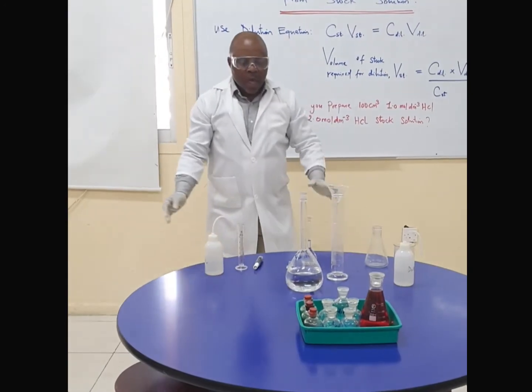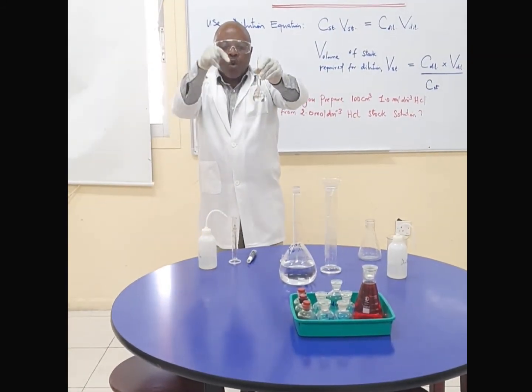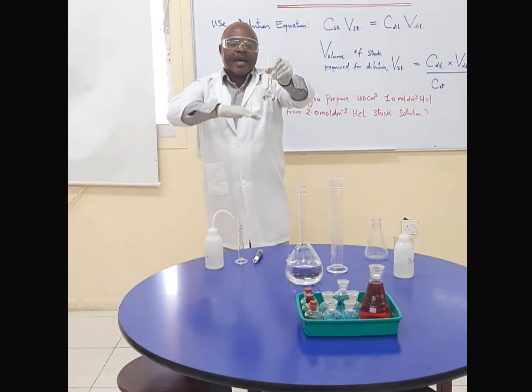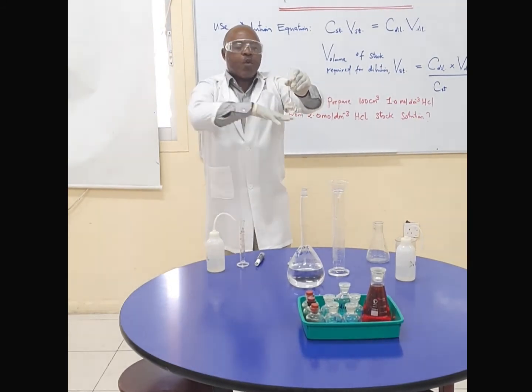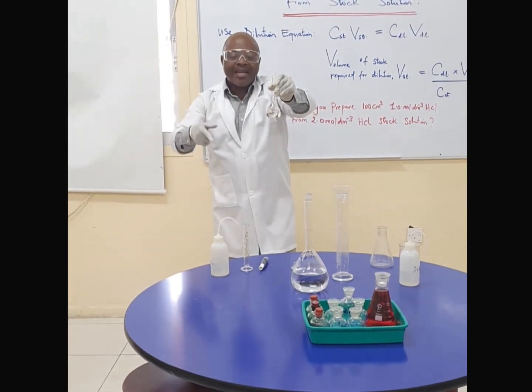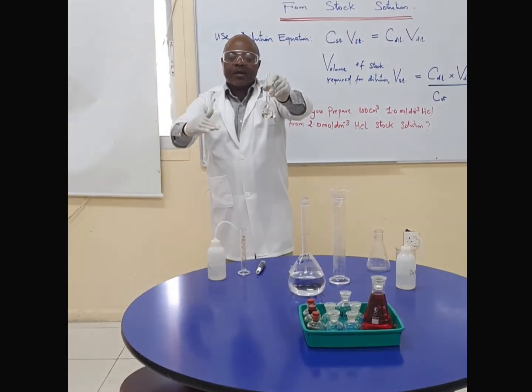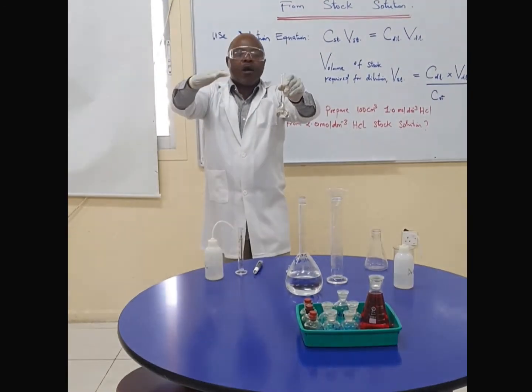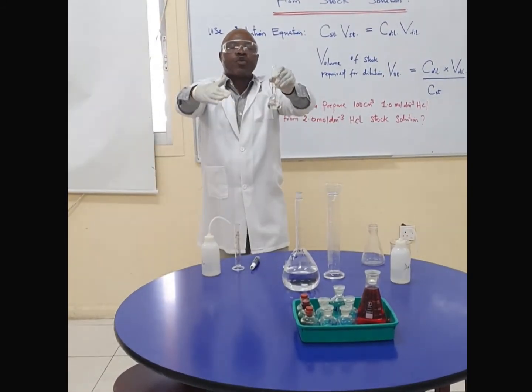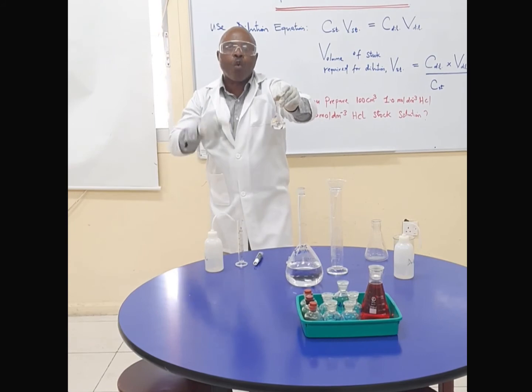Why do we have to add the acid to the water? If we add acid to water, the molecules of the acid are denser than those of water, so the molecules will diffuse among the water molecules, and the reaction will be okay. Should we add the water to the acid, water is less dense than the acid. What happens is a layer of the water will be up and the acid will be down. Because of this, there's a reaction that can lead to explosion. That's why it is necessary you add the acid to the water, not water to the acid.